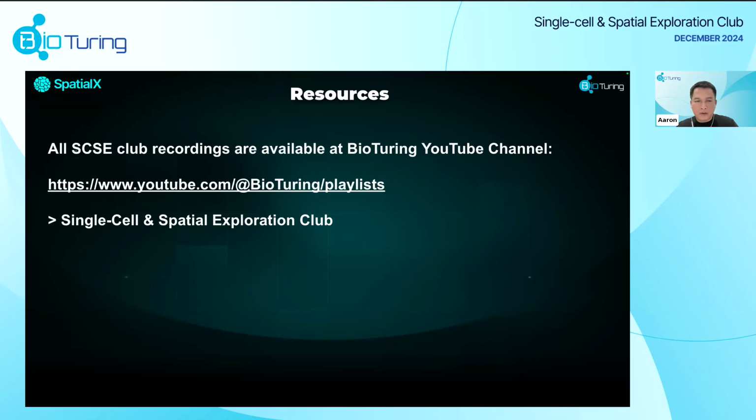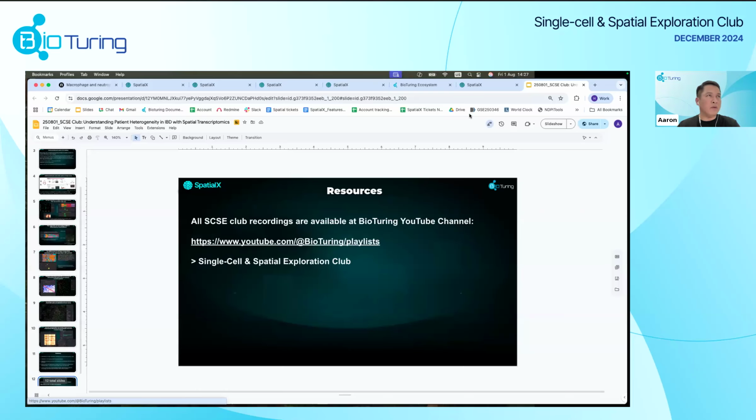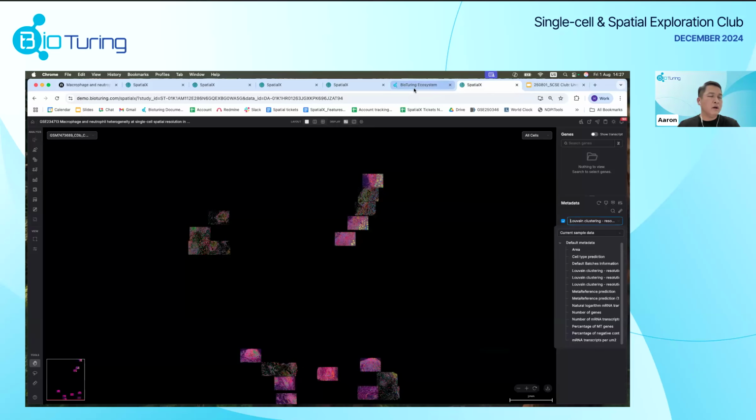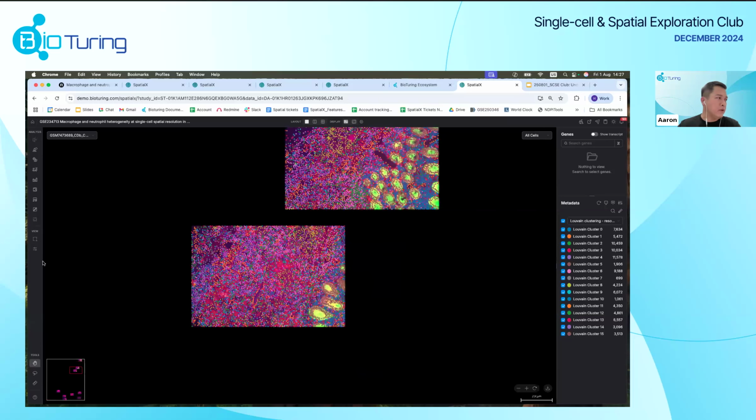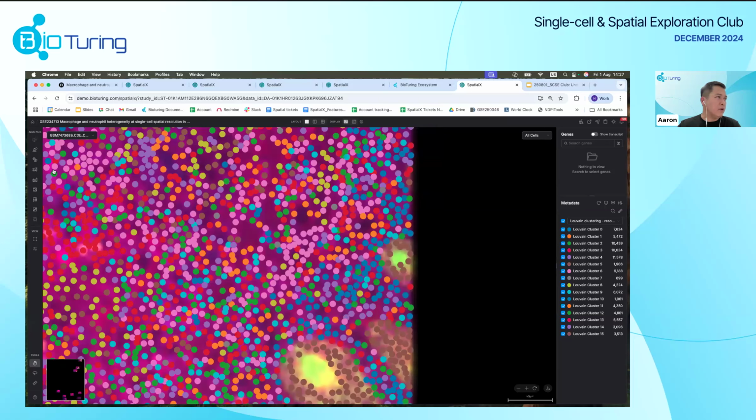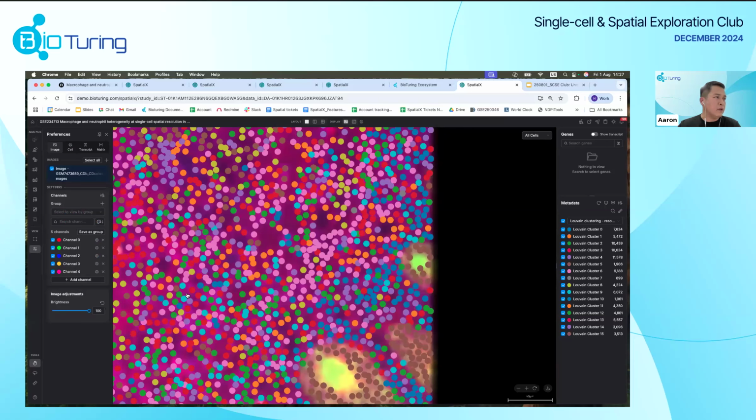I think I have one question about cells. Besides the cell proportion that we can compare between different conditions, we also have the annotation tool, which is one of the tools that people are interested in.